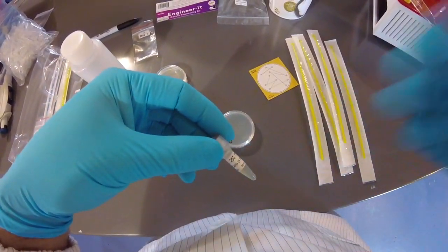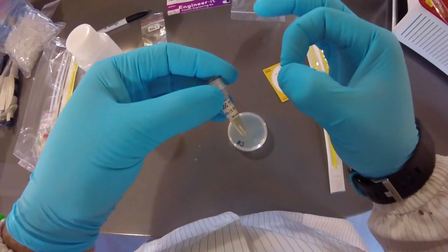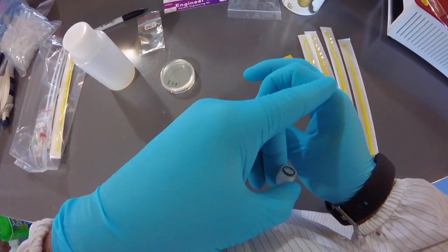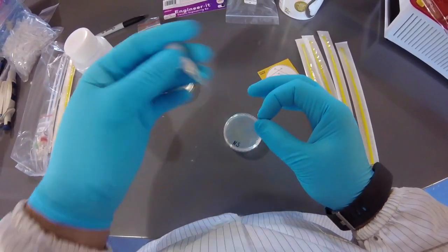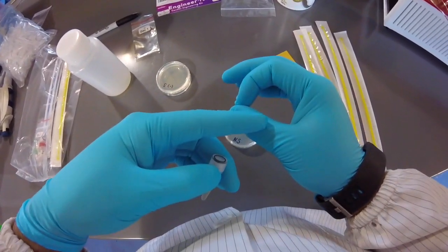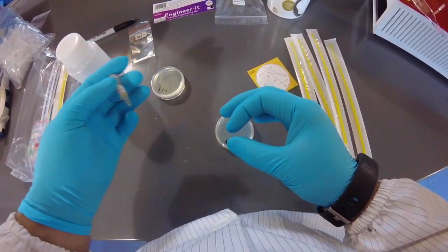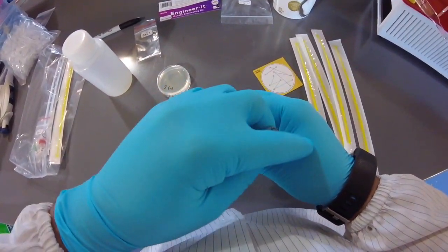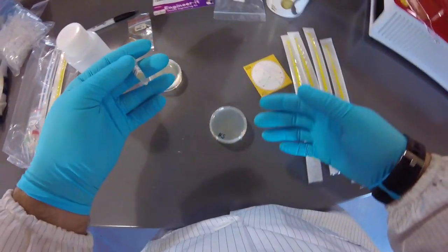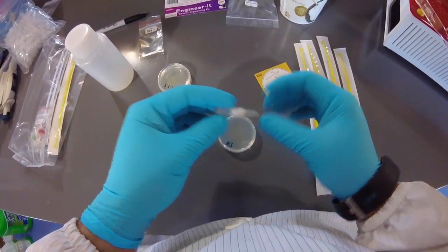And tomorrow we'll be engineering with plasmids, and we'll talk more about what they are, but basically they're just a very small loop of DNA that in general has a gene that you want to express, such as a colorful pigment. It'll have a gene for selection, so that the organism can become resistant to an antibiotic. And then they have a little segment called an ORI, or origin of replication, which tells the cells to copy them, okay? So the plasmids are what we're going to be putting into these cells tomorrow once we have colonies.